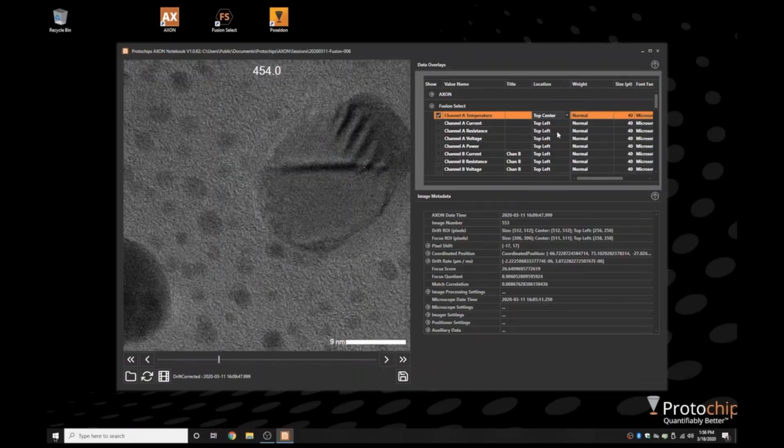This is that notebook application that David mentioned, and this is a non-licensed part of the deliverable on AXON. So instead of doing all the work to publish and to scrub through your data on the microscope, you'll probably do this off at your office or any number of computers around your facility. If you have colleagues that collaborate with you and generate data on your microscope, they don't have to tie your TEM up either. They can take the data and they can install this software on their own systems and do the analysis and publication there.